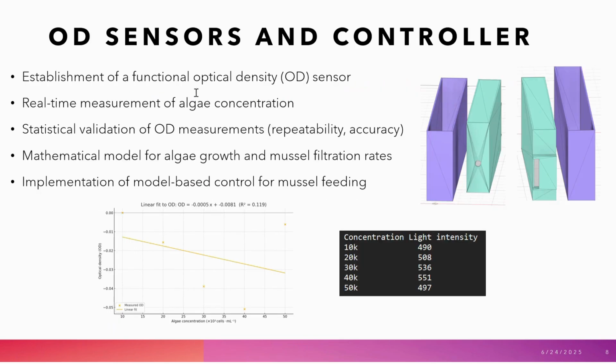When it comes to the OD sensors, we made OD sensors work. We measured the values with it, like intensity, OD. We plotted the graph and showed the results.